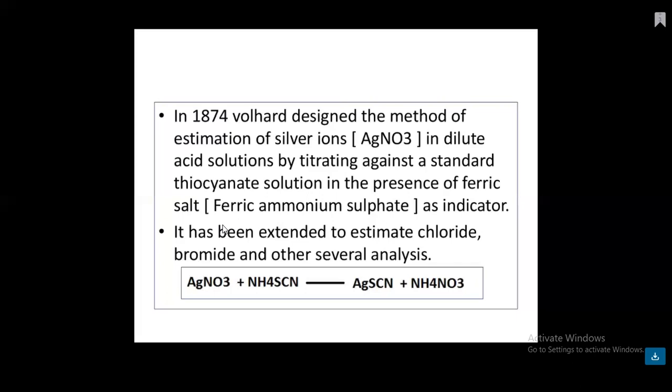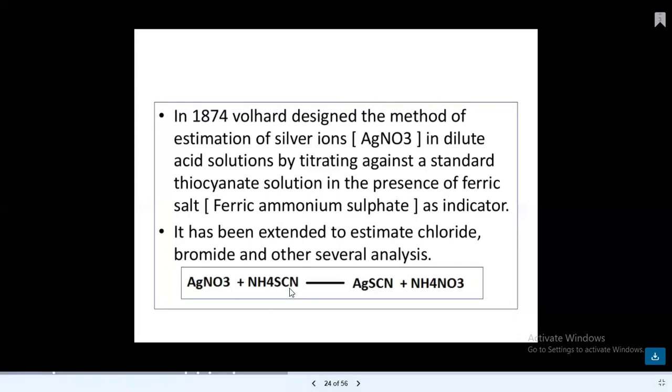As we discussed earlier, the silver nitrate in argentometry quantitatively reacts with halides or thiocyanate. So here we want to measure the leftover volume of the silver. So we take the thiocyanate in the burette, not as a titrant, but as a third reagent to find out the leftover volume of silver. The thiocyanate reacts with the leftover volume of the silver and converts into silver thiocyanate.